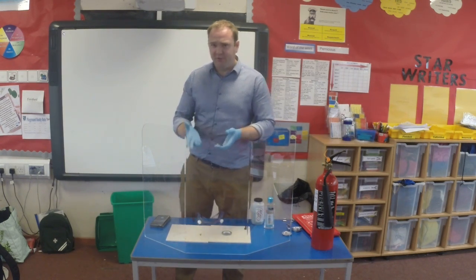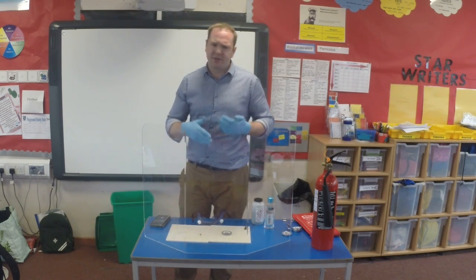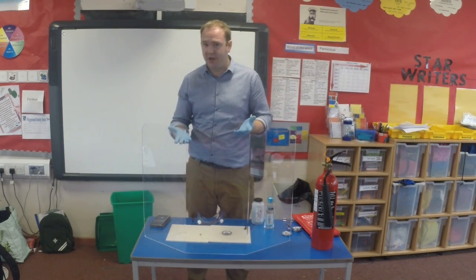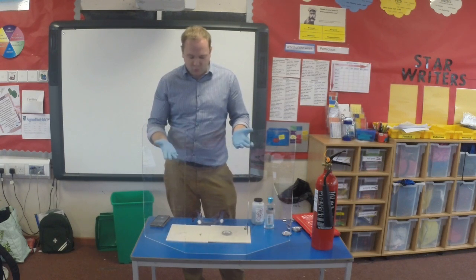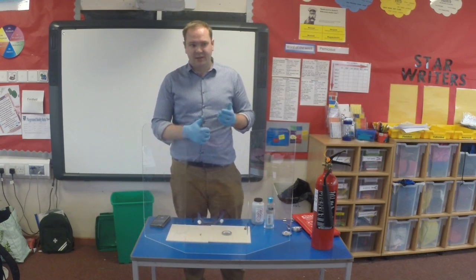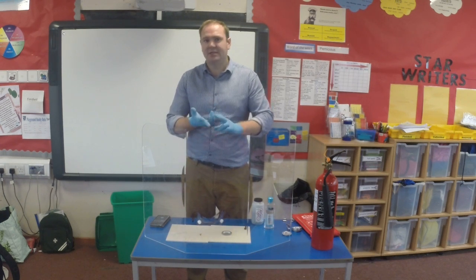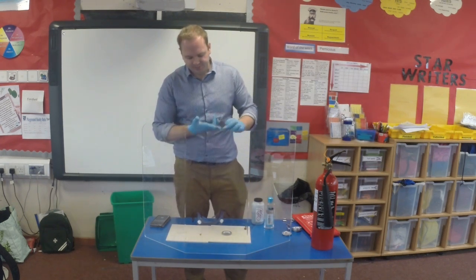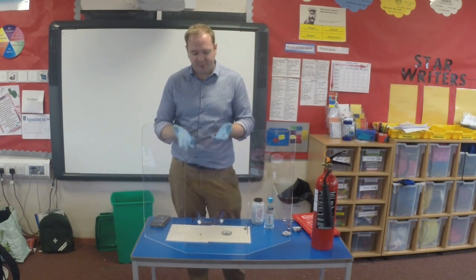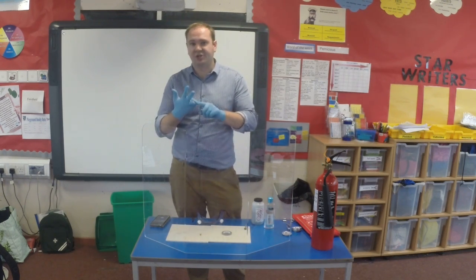Now, in terms of learning outcomes, this one covers a couple of different things. Any lesson sequence that is focusing on chemical reactions in general, this is quite a good one. It shows several of the signs of a chemical reaction. We get a little bit of fizzing to start off with. We get the production of heat and light, all of which are good signs of a chemical reaction. We get the obvious production of a gas as well, which is a separate product from the reaction. So all of those are obvious signs of a chemical reaction taking place.